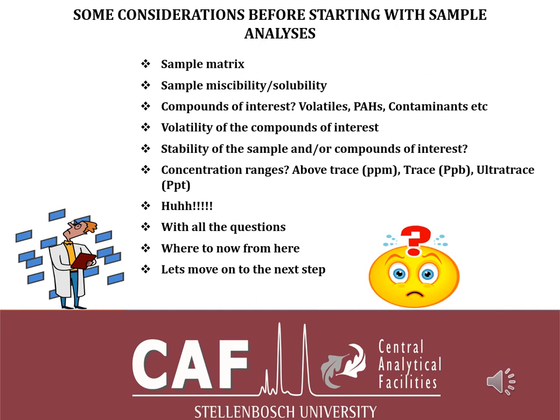Sometimes when we want to do sample analysis, we just get carried away and we forget to pause a little bit to ask those relevant questions. I know there are some clients who come to you, present you with a problem, and just want you to find a solution. But if you don't ask those questions, you will not be able to give the client the right solution, because you might think you've given them the right solution, only to find that you're giving them something different.